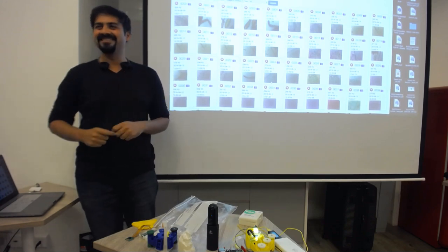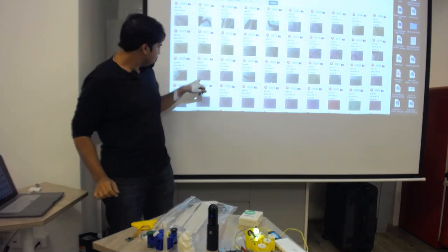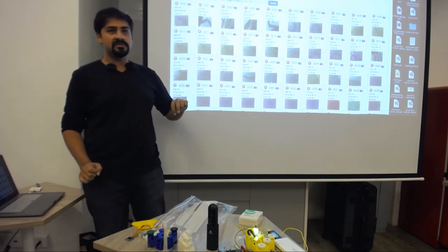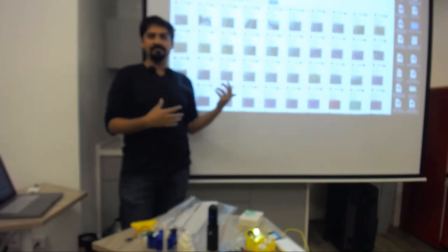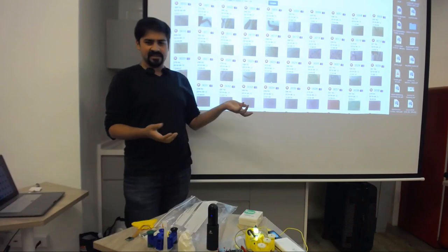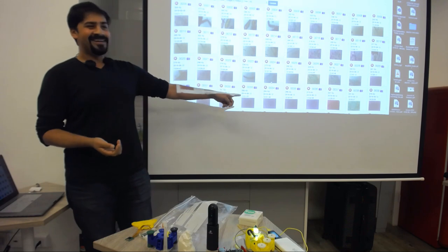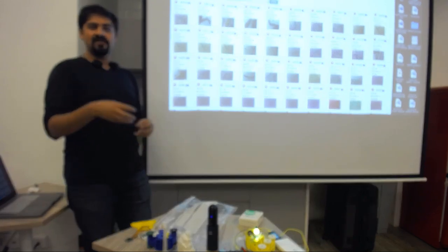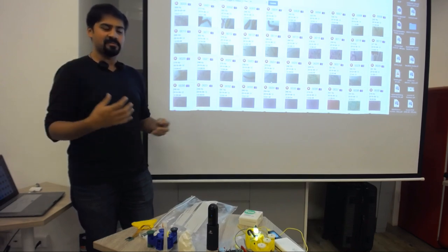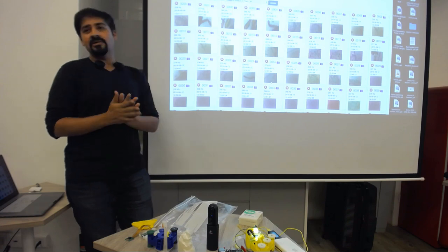Can you see bacteria? You can see bacterial colonies. In fact, I think this is one of them. Not individuals. That's kind of how I wound up in this strange world of I don't know what I'm doing. Because I'm a geek, I have no idea what science is and what cells are. But I wanted to find bacterial cells, and I was hoping that I would stick it in there and see all the bacteria I wanted to see in the world. But turns out you have to get them to colonize first. And I'm Indian, so I know nothing about colonies.